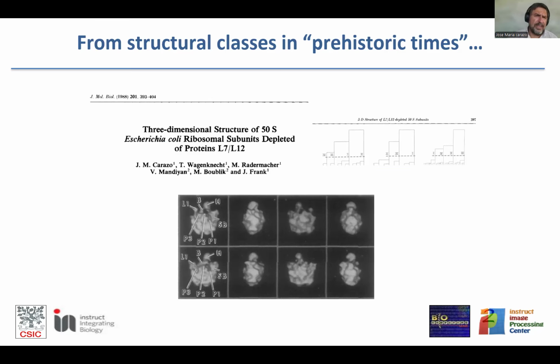But probably this is the first study in which we were able, working with Joachim Frank, to make 3D classification and 3D class analysis with negative stain, which increased the signal-to-noise ratio a lot. We were able to do it in a simplified manner, certainly for hundreds of macromolecules, and with all the problems of hierarchical ascendant classification and things like that.